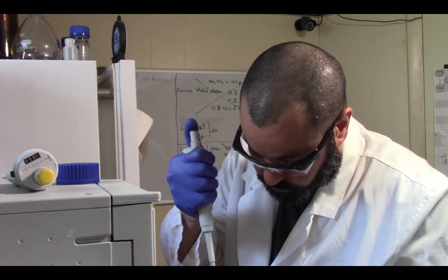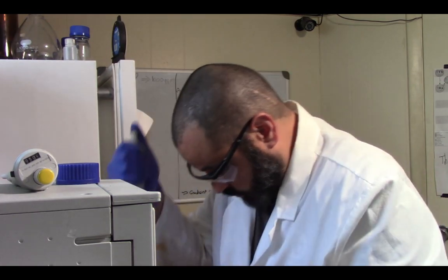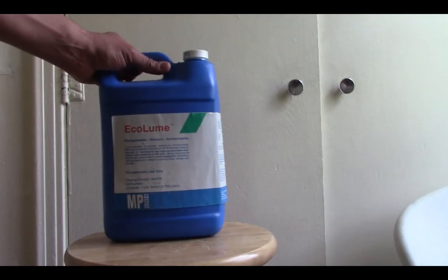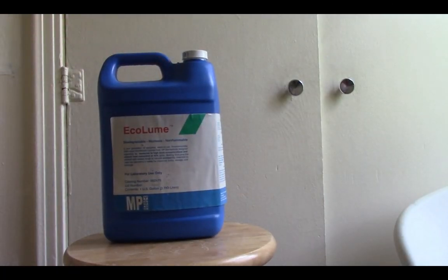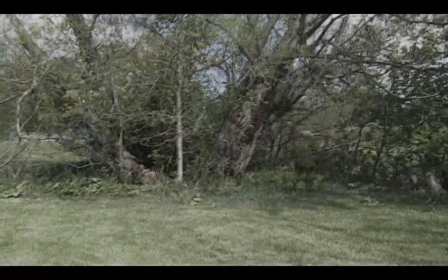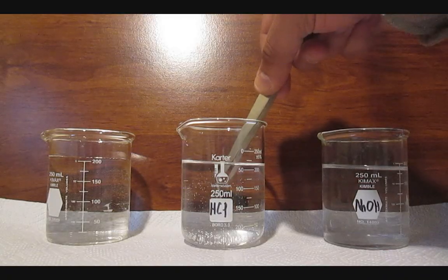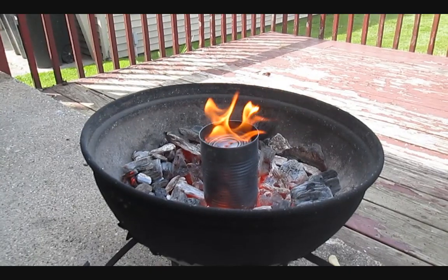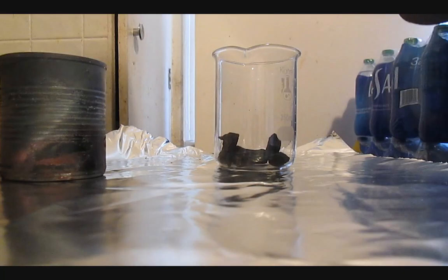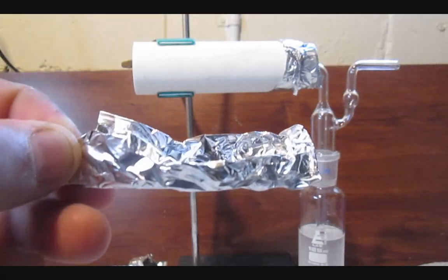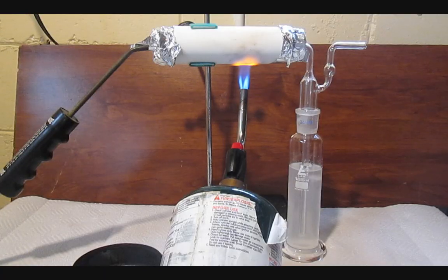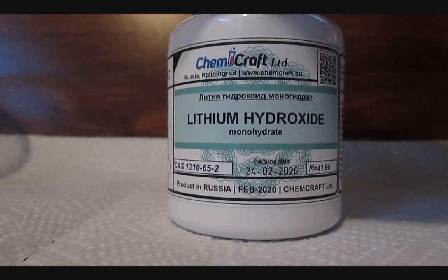That benzene is then weighed and mixed with the scintillation cocktail for counting. Since we only care about the isotopic ratio, the amount is irrelevant, as long as it can be detected. Earlier in the video, I mentioned Ecolume accepting high water and ionic samples, so my process is a bit easier. I begin with the same wash for my sample, which is then carbonized the same way you would make charcoal, heated in absence of oxygen.